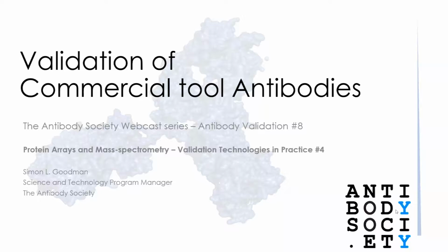Hello everybody. Welcome to the Antibody Society webcast series on antibody validation. In this, the 8th episode, we're going to discuss some methods for looking more broadly at antibody specificity and selectivity, protein arrays, and immunoprecipitation coupled to mass spectrometry.